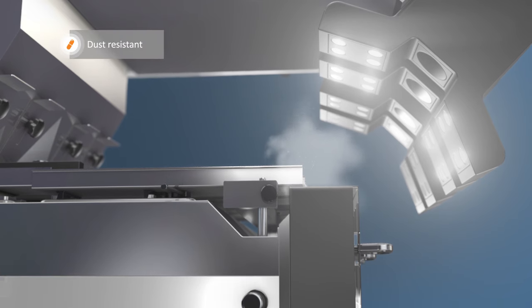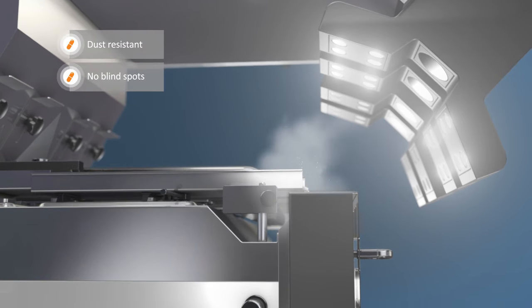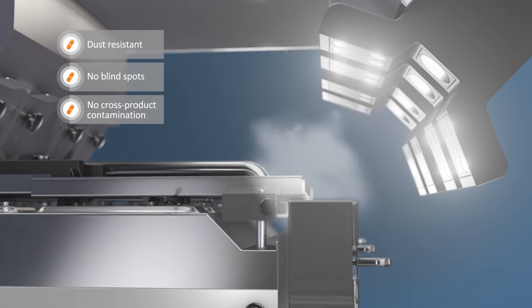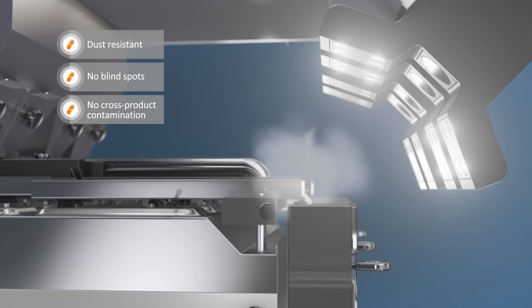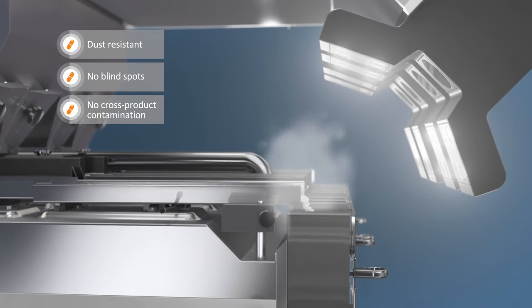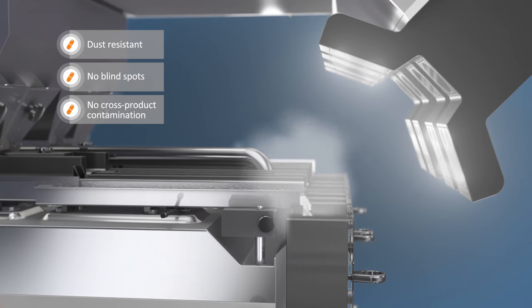The camera unit is positioned separately from the track, resulting in low to zero sensitivity to dust. It also saves the need to disassemble the unit for cleaning.